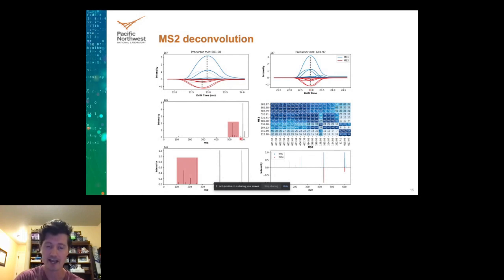But you'll notice that here in this box, I'm showing MS1. We have our mass of interest, the 602, but we also have these things in the 500 to 600 range, which would fragment alongside the 602 and contaminate, for lack of a better word, our fragmentation pattern. And highlighted in this pinkish orange color are those corresponding to the 500 to 600 range.